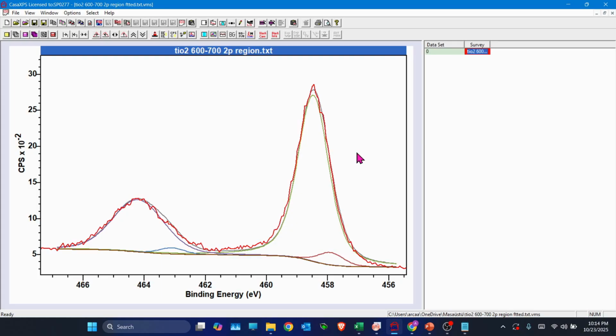This was the video for the data exportation from the CasaXPS.